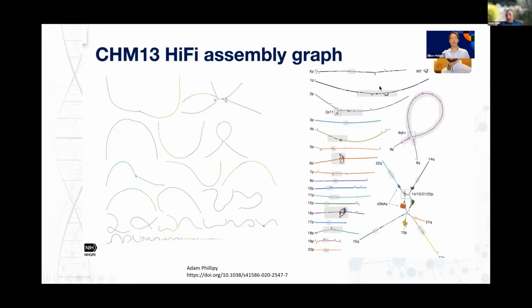The only other technology that was quite useful, and this is where I think ONT, Oxford Nanopore, is quite useful, is being able to resolve these little bubbles in the assembly where you've got really long repeat regions like ribosomal DNA tracks, or really super low complexity regions where you need to manually join the contigs together.